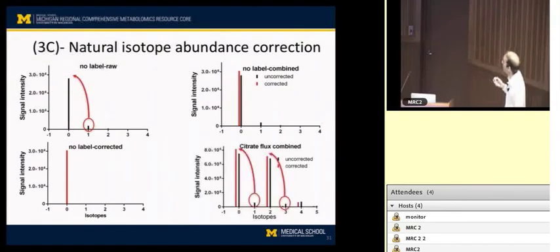But when we have a flux study, then what happens is we avoid ambiguity. Was this signal at 13C2, some of it could have been coming from my natural isotopic abundance distribution, and some of it may not. Additionally, things that are 13C2 labeled will have a little bit of additional labeling corresponding to the natural isotope abundance in the other as yet unlabeled carbons, and we need to correct for that. So the fact that we have all of these multiple isotopes and multiple carbons means it's not just so simple as subtracting and adding. We need to use formulas that account for the relative distribution of the labeling, and really it winds up being a computational process.